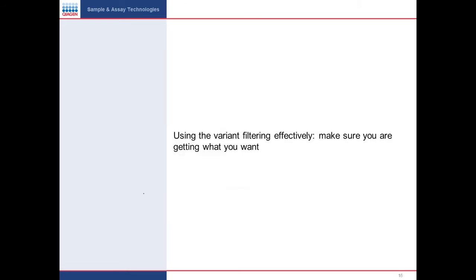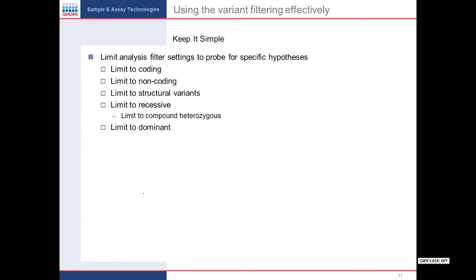So we talked about how to get set up. We talked about how to work with artifacts. Now let's talk about how to make the best use of filtering within the application. One of my mantras, along with artifacts are your enemy, is that you want to keep things simple.